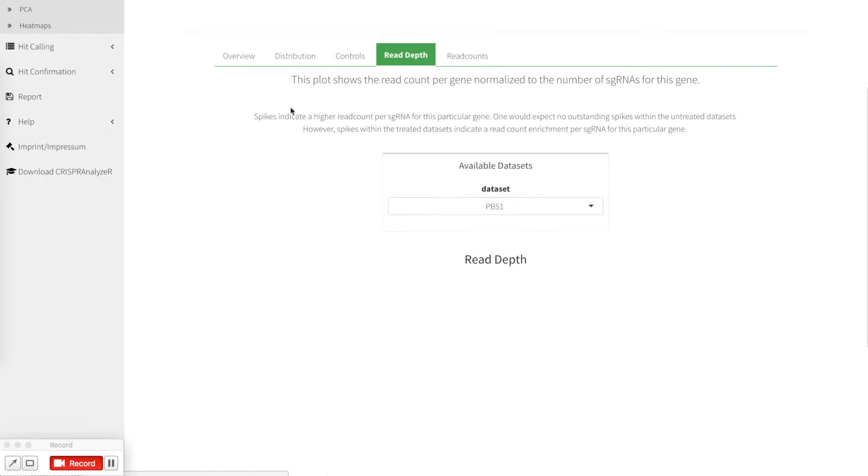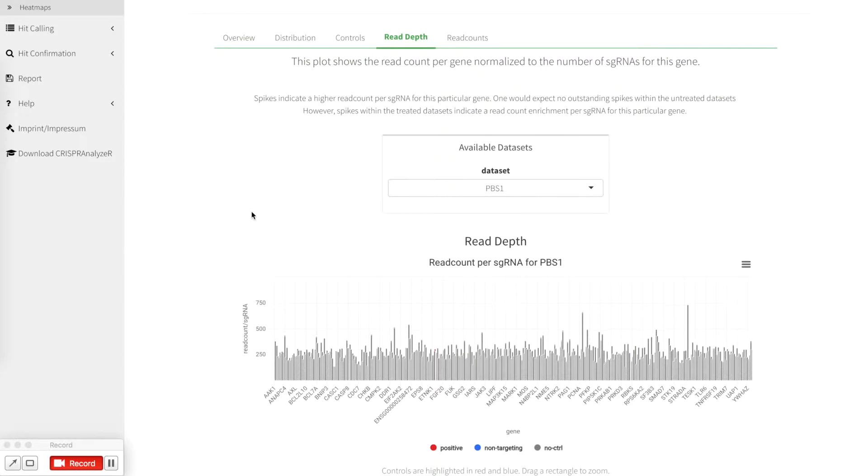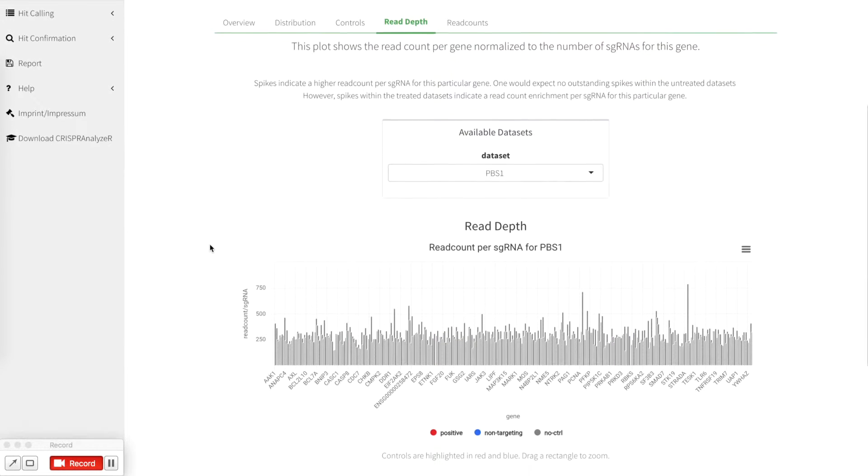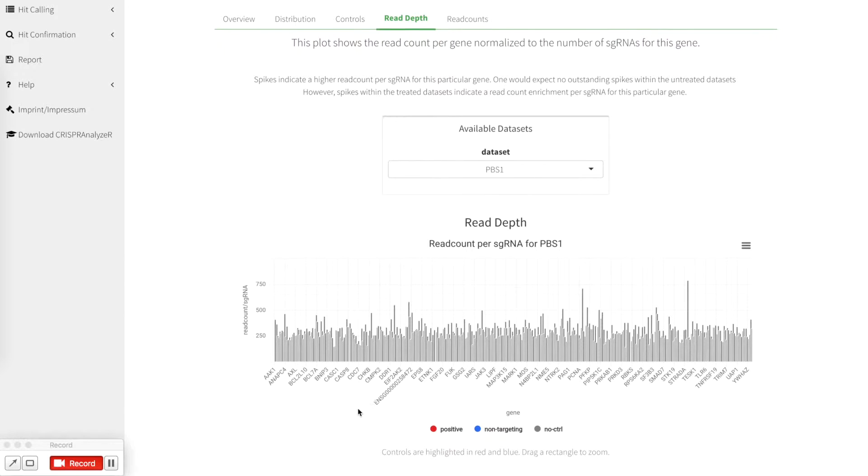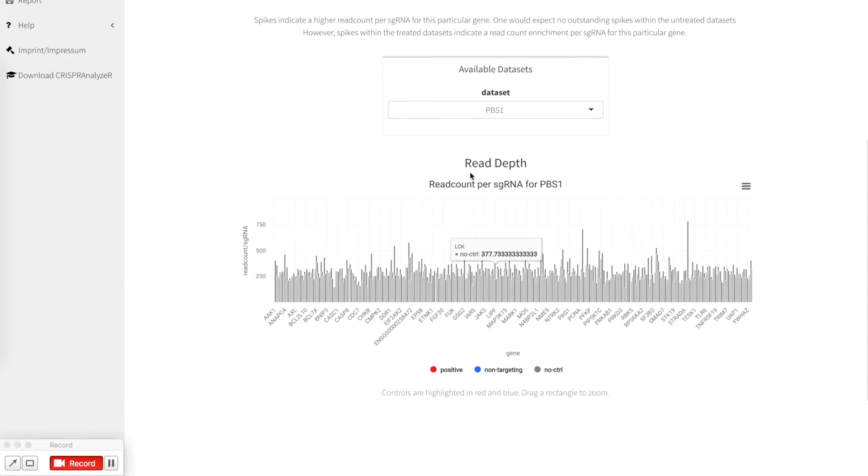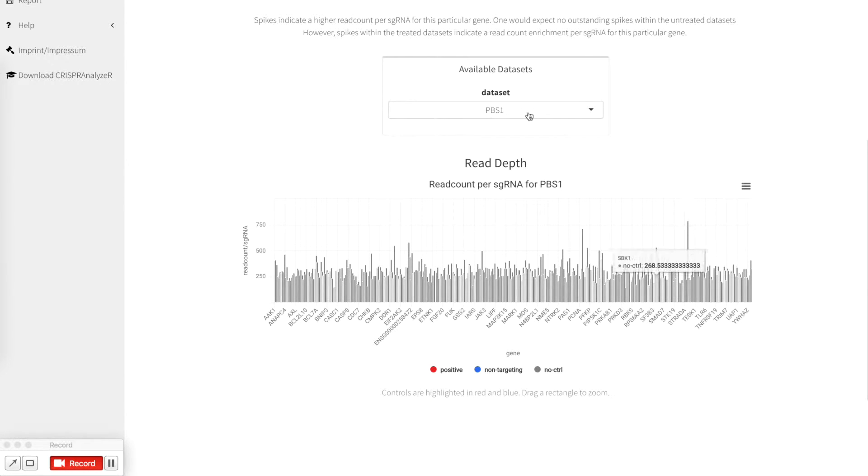As a next step we included a so called read-death plot which shows you the read count for a certain gene divided by the number of sgRNAs, giving you a rough estimation if you have skewed data. So for PBS, for untreated control, you can see that there are just a few pikes coming up.